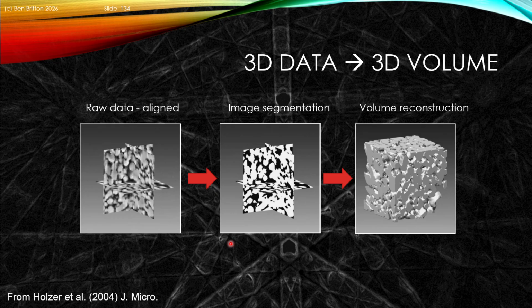So, one of the important aspects is once you've got the raw data and it's well aligned, the slices are put together, that tomograph looked very pretty, but actually the trouble is what do you want to do with that data? And so here, effectively, 2-dimensional data is quite nice. You can print it out and point at different features that are interesting. 3-dimensional data becomes super annoying because you might want to look at the connectivity or porosity.